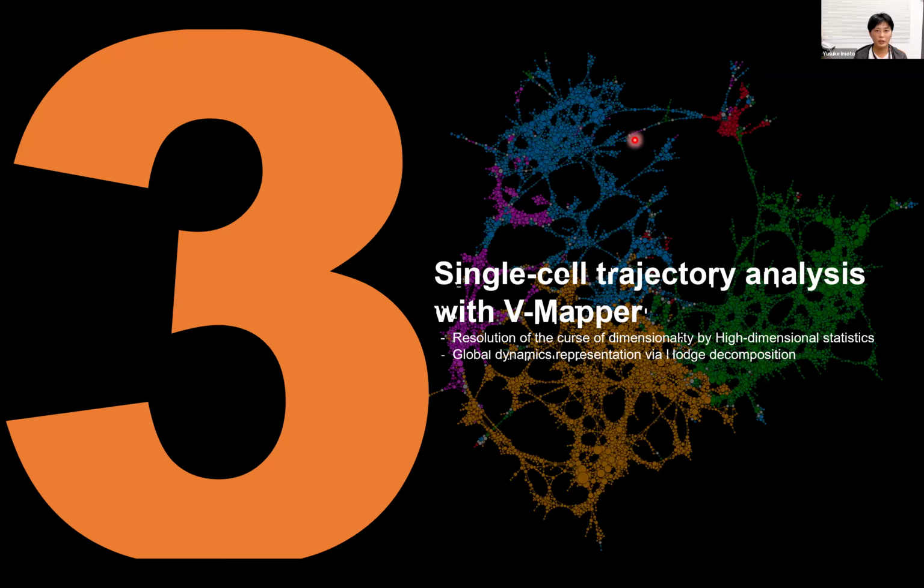In the third section, we applied the VMapper to real single-cell data in order to infer the trajectory of cell differentiation.